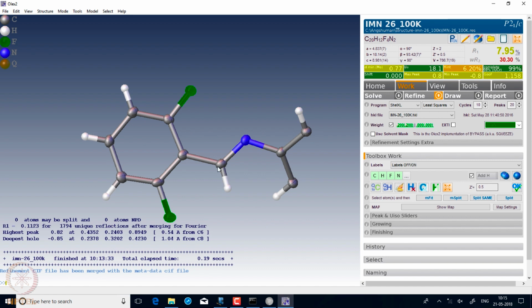This one is an ethylenic hydrogen, and since it is connected to an sp2 carbon, the bond length is once again 0.93, and the angle that is fixed is 120 degrees, which is the ideal angle of CH. Here the exterior angle for that CH bond has been fixed at this.